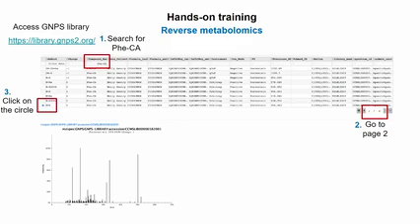Vincent, you're using neutral molecules here. You mentioned at the beginning the diamino compounds, the polyamines. In their spectra you get a very small 337, almost insignificant, because the charge is on the side chain and not on the molecule. Does this work? Yeah, I think it still works, right?